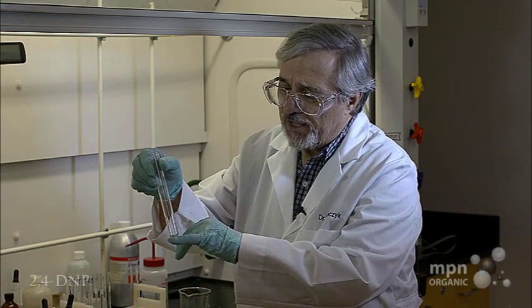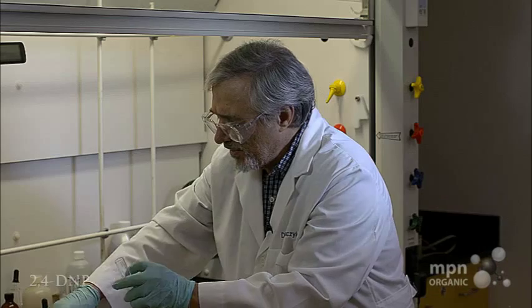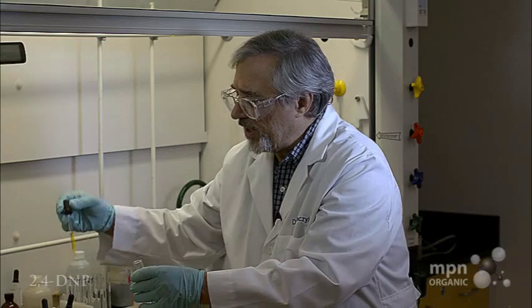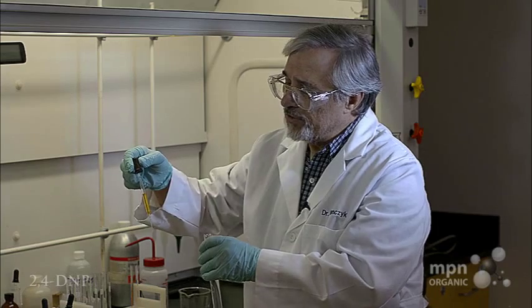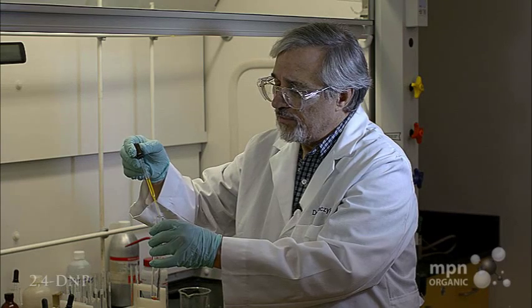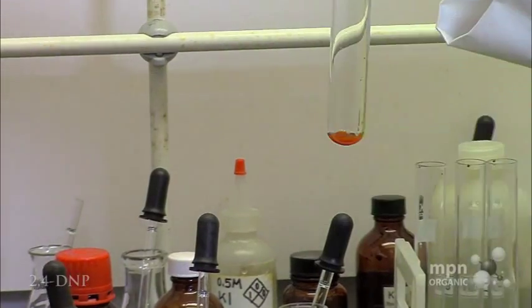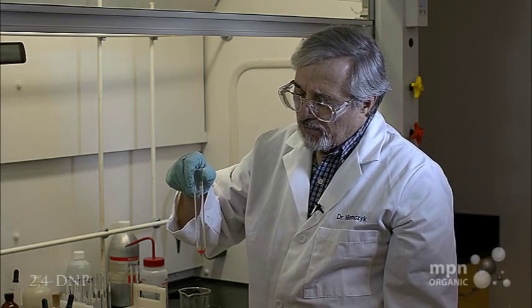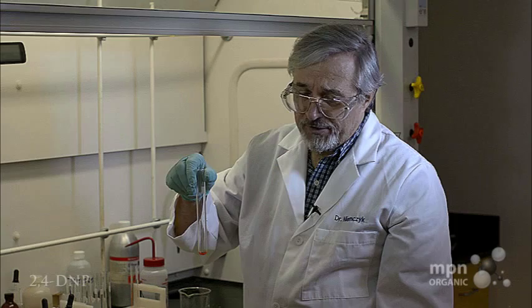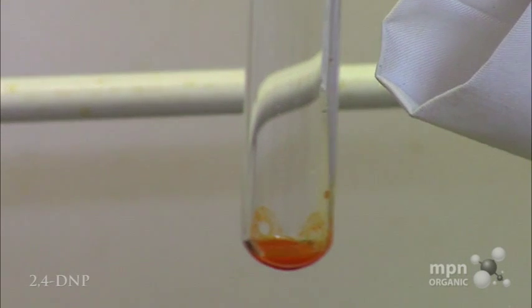So we've got paraanis aldehyde in there. Now let's take the 2,4-DNP reagent, and you can see that it's a yellowish color. Now when I drop this in here, you can see that almost immediately when the reagent contacts the paraanis aldehyde, we get the formation of a bright orange solid.